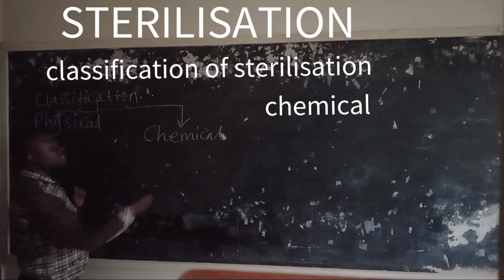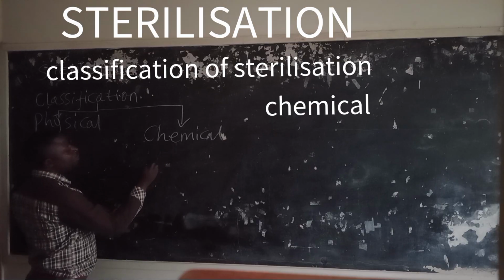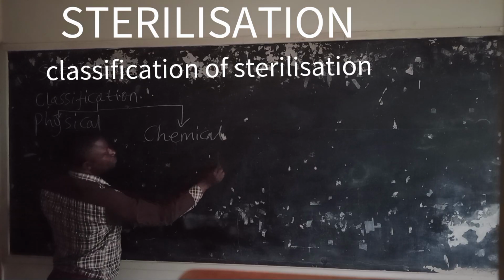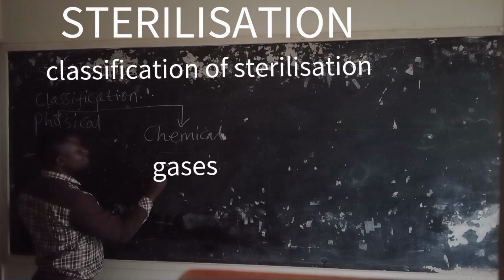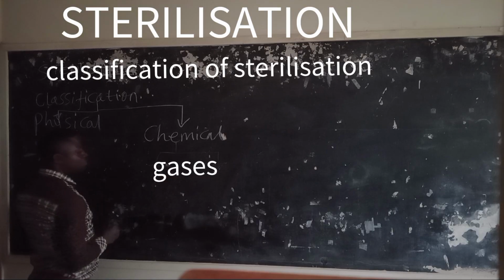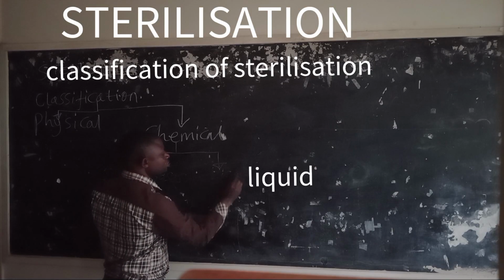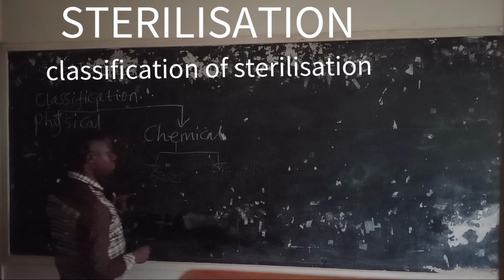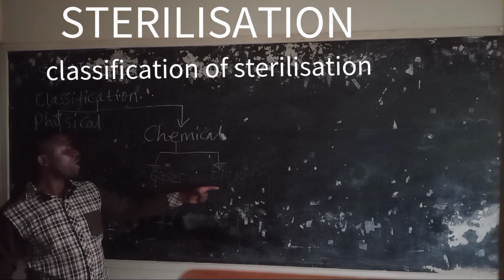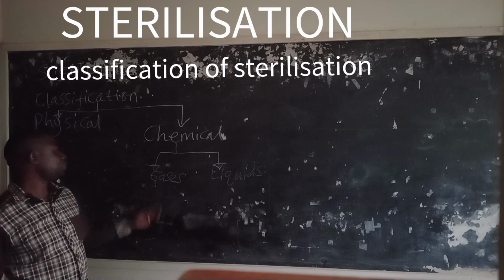Under chemical sterilization, here you can classify them into gases and liquids. We have gases, we have liquids under chemical sterilization.